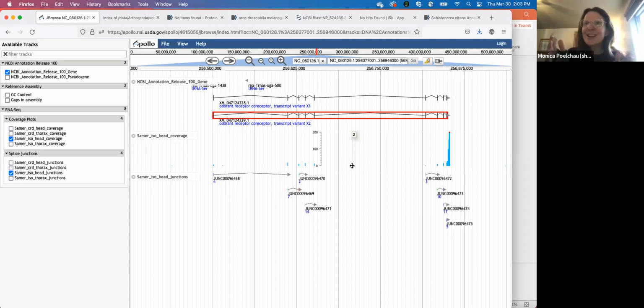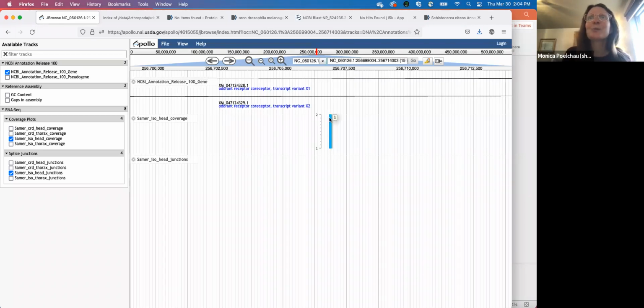If there's a glaring change, like I have some examples in the other webinars that you'll see, where it's really obvious that there's an exon missing right here, and we really need to add that exon or multiple isoforms, then it could be fun and straightforward. But if you're crossing your eyes and thinking, does this two base pair, this two read alignment mean anything biologically? No, you probably don't want to waste your time doing that. So you have to keep in mind the end goal of your annotation process versus how much pain you want to invest in using Apollo and doing the structural modification.